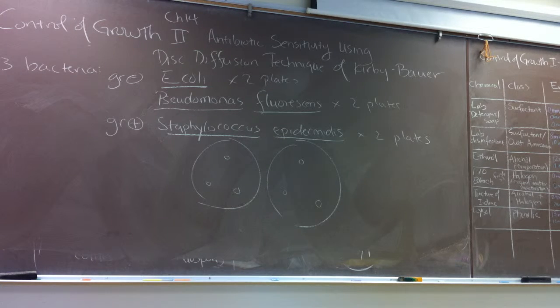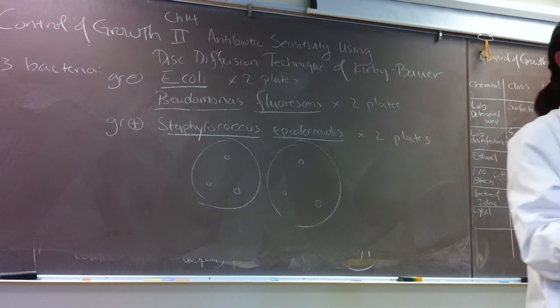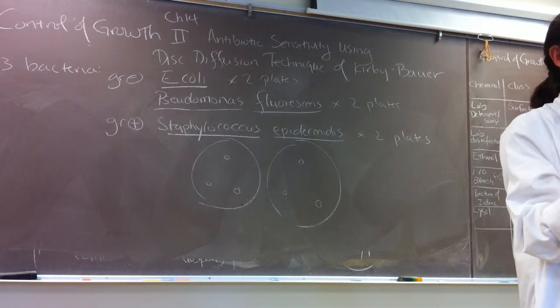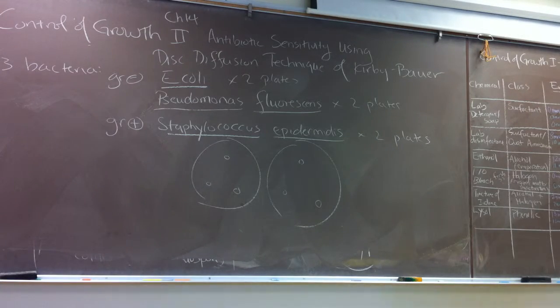The disc would cooperate. Okay, so it drops, and then I'll use the tips of my forceps and just gently apply pressure to the center of the disc, just to make sure that it's attached to the agar surface. Okay, and then I move on and place 2 other different antibiotics on my plate. Okay, applying a little bit of pressure, because when you're finished applying your discs, we are going to have you tape the plates together, tape the lids to the bottom.